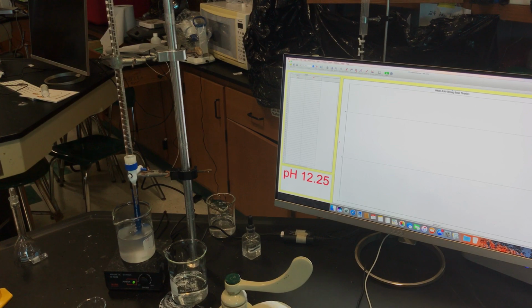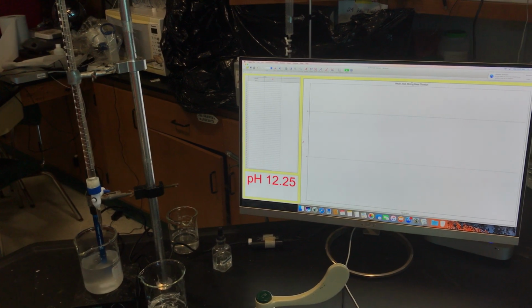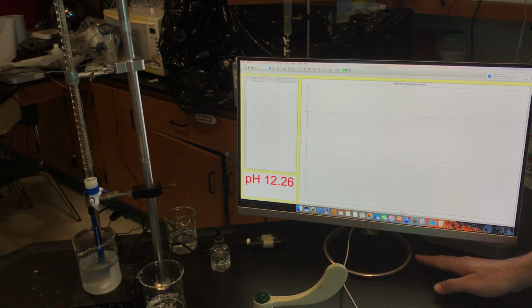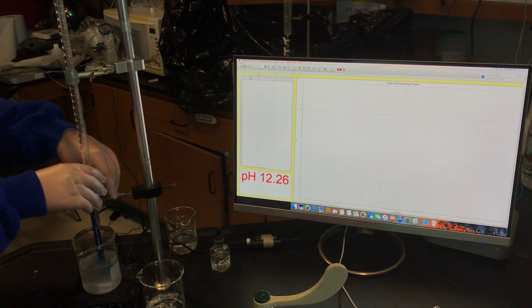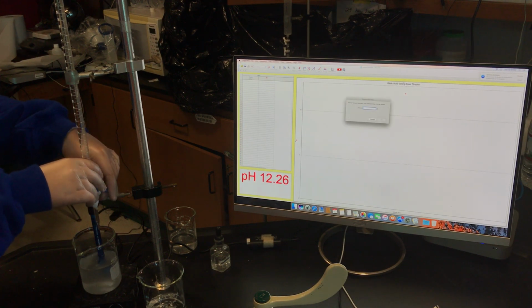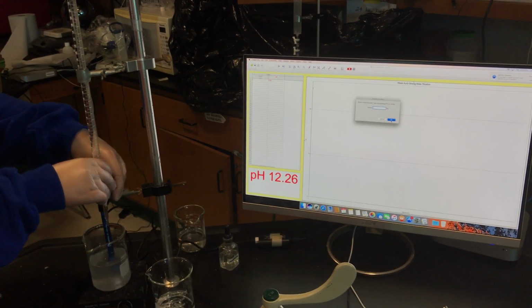All right, we're almost done. Okay, we're going to do this like we did our other titrations. We're going to add 1 milliliter at a time. Okay, student E. Okay, someone click on the green button. Are we doing one by one? Yeah, hold on. And now click the keep, don't do anything yet. This thing? Yep, and type in 0. Good, hit enter. Okay. Now, student E, formerly known as Evan, what you're going to do now is you're going to let out 1 milliliter.